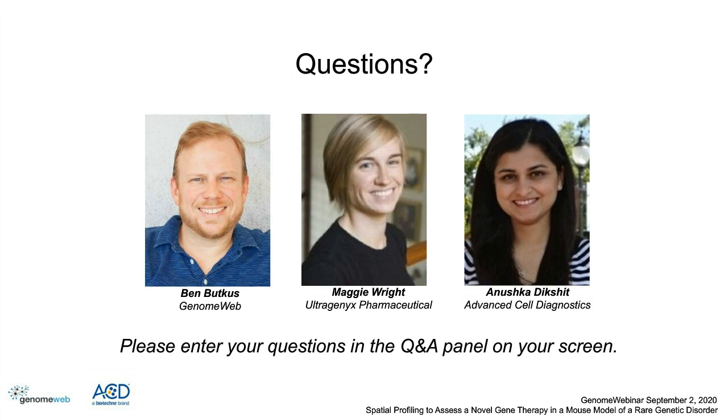And once we compared them separately and saw that they were performing the same, we feel confident in our ability to group them together and give a little bit more power to our ability to see changes between the treated and the non-treated groups once we had the treated groups of both sexes grouped together. So we did look at them separately, and because of the way that we designed the study, they performed very similarly.